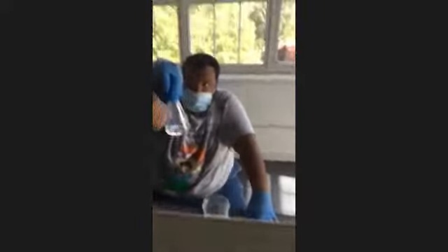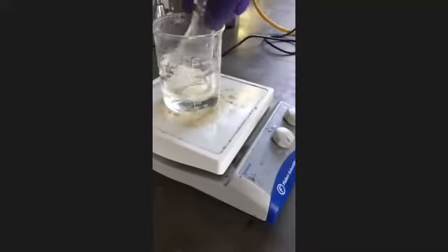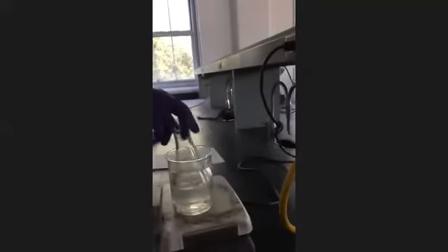All right. What about you back here? Is it going in? Hold that up. So you can see his has gone clear. That means the reaction is almost complete. And same here, you want to get that last little piece reacting. Keep heating it, because the problem with the acetic anhydride is, if it's not hot enough initially, what you end up doing is evaporating off some of your acetic anhydride, and that screws up the reaction.